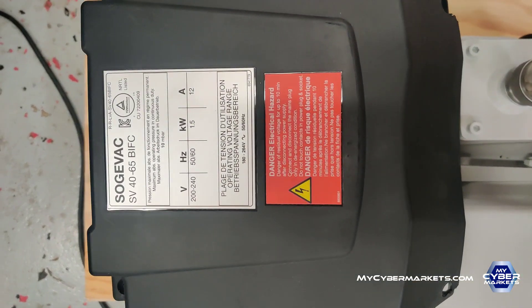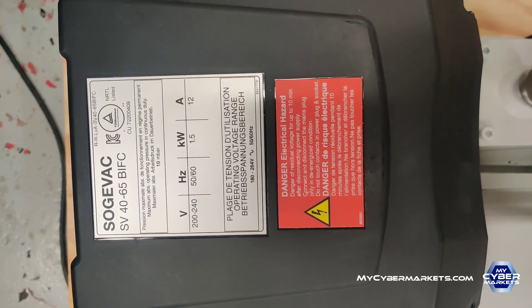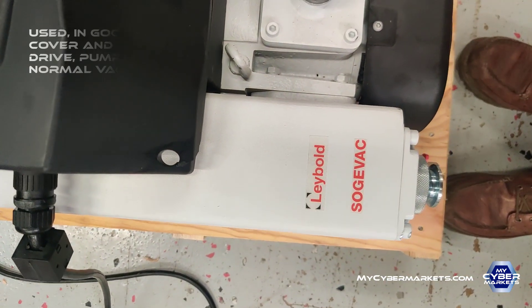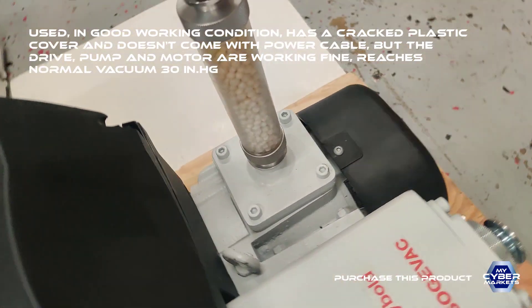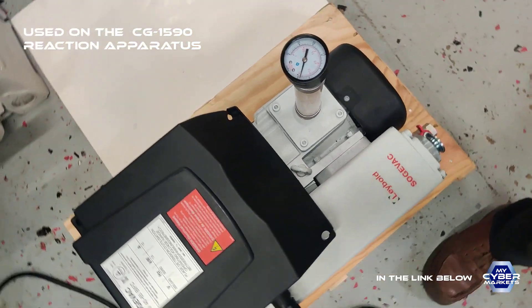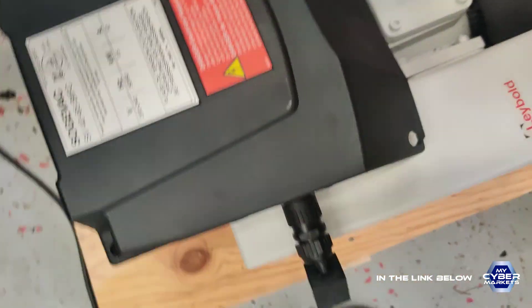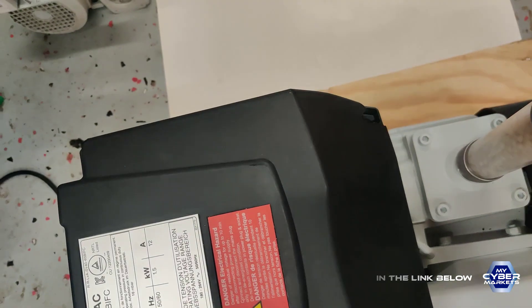Welcome back again. In this video we are going to test the Sogevac SV40-65 BIFC vacuum pump. It's labeled Sogevac. We have installed an air filter and a pressure gauge, which will measure the vacuum in the pump. We have plugged it into power and we'll start it right now.